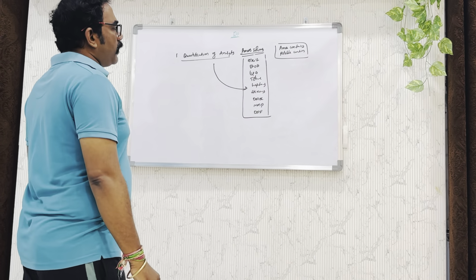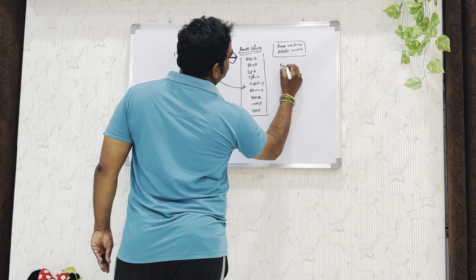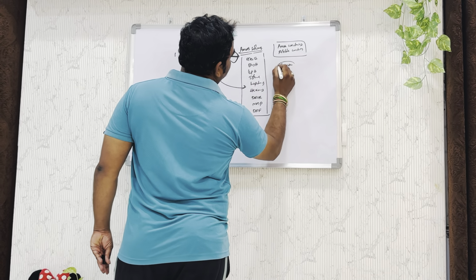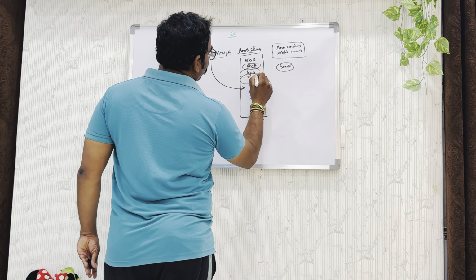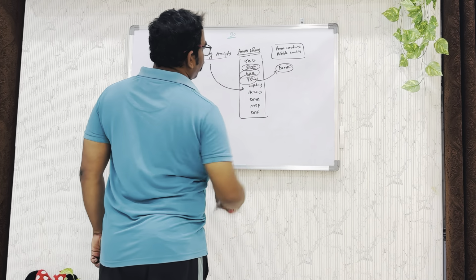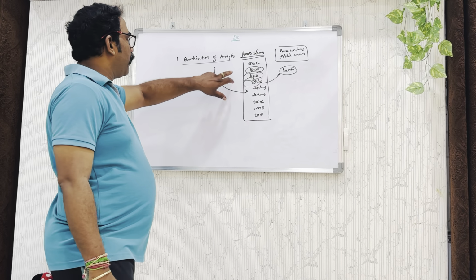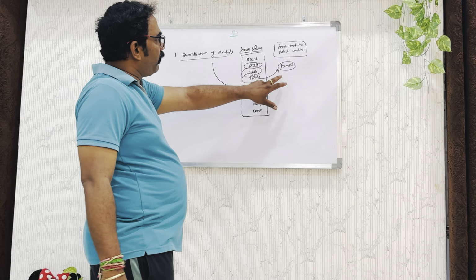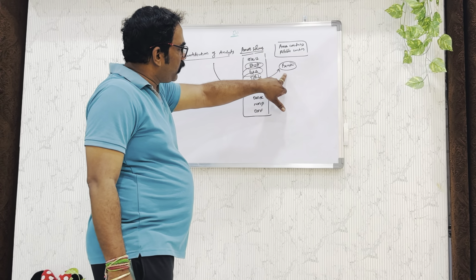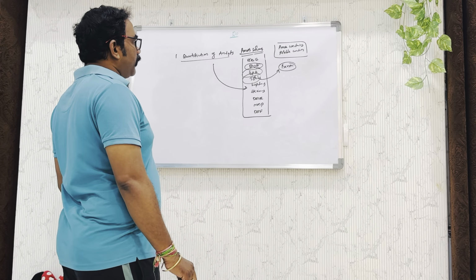Here a possible contaminant we can consider is benzene, because in the manufacturing of ethanol, IPA, toluene, benzene might be present. After completion of the drug substance, along with the solvents, we compulsorily need to show the control of benzene in the drug substance as per regulatory requirement.